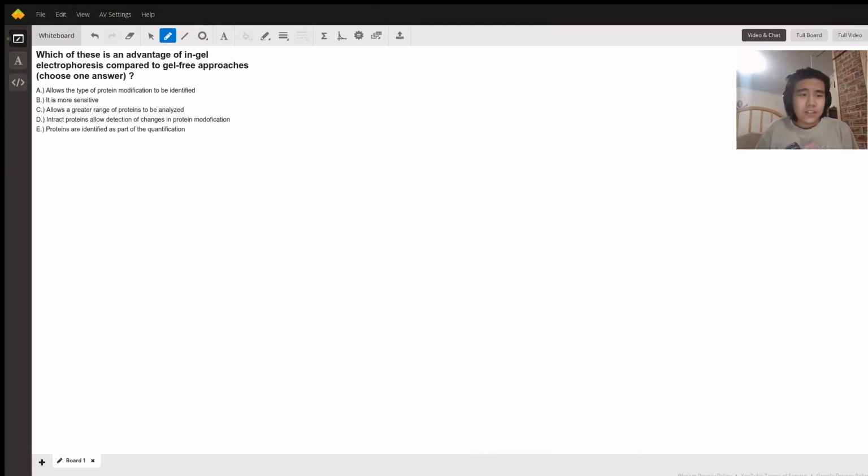Hey, Pawnee. So you asked a really great question, and what we're going to do is go through each of these answer choices one by one to try to figure out by process of elimination what the answer is here. And first, just some background. So you're asking about the advantages of in-gel electrophoresis compared to gel-free approaches.